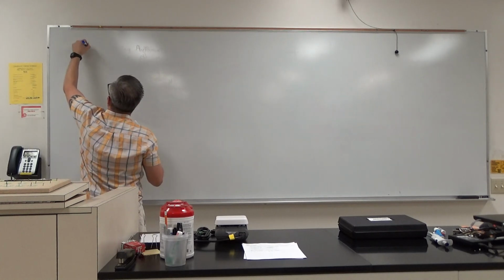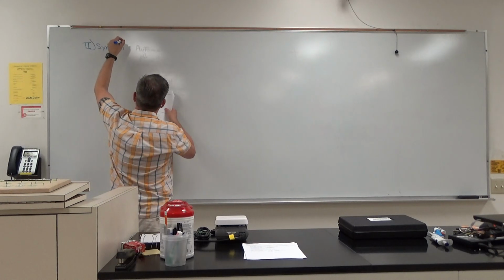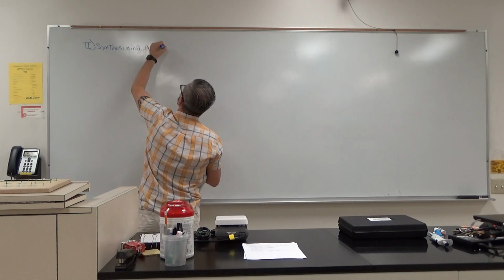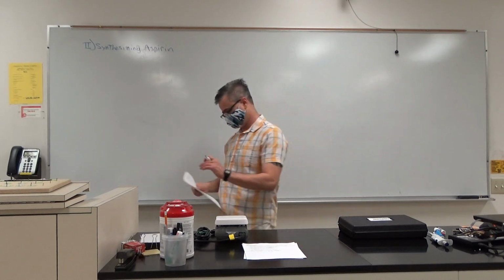All right. So, synthesizing aspirin, or otherwise known as acetyl salicylic acid. The starting material we use is salicylic acid. When we convert it into aspirin, it's acetyl salicylic acid.